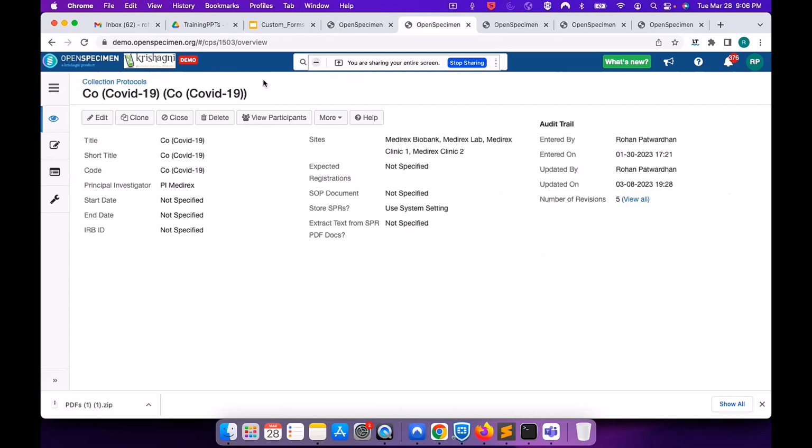But why are you asking it? How exactly do you do that on a yearly basis? Is it done by one protocol at a time, or is it done across the system? No, the SOPs are based on the protocol, but sometimes there are changes in some of the processes, so we have to update that SOP.